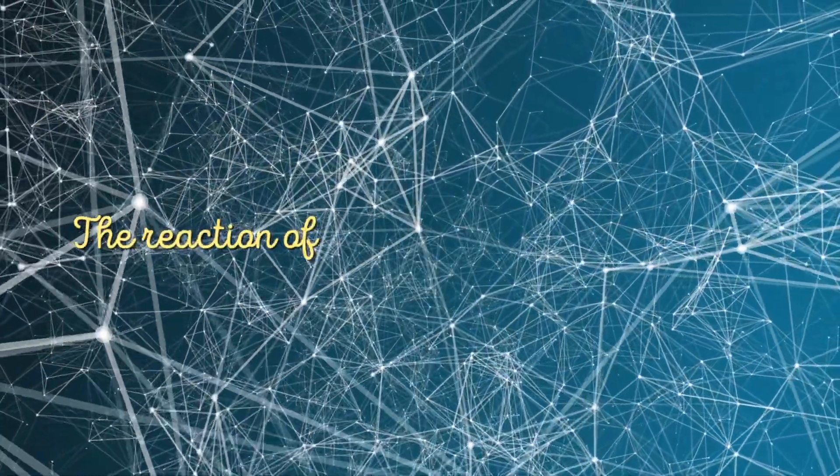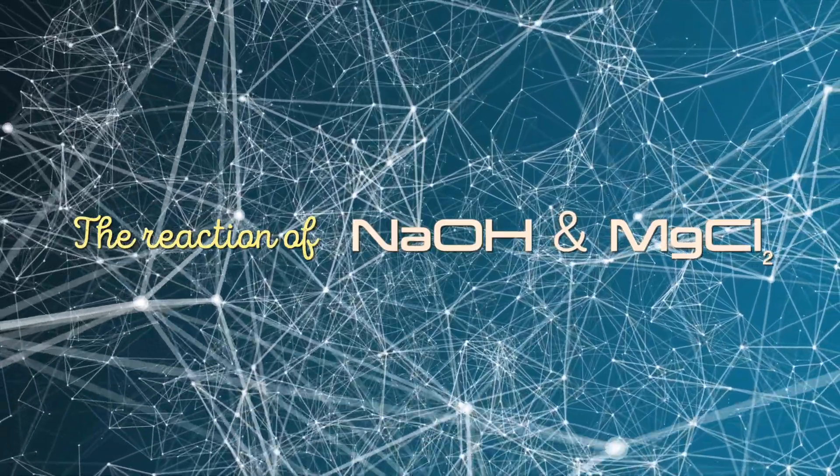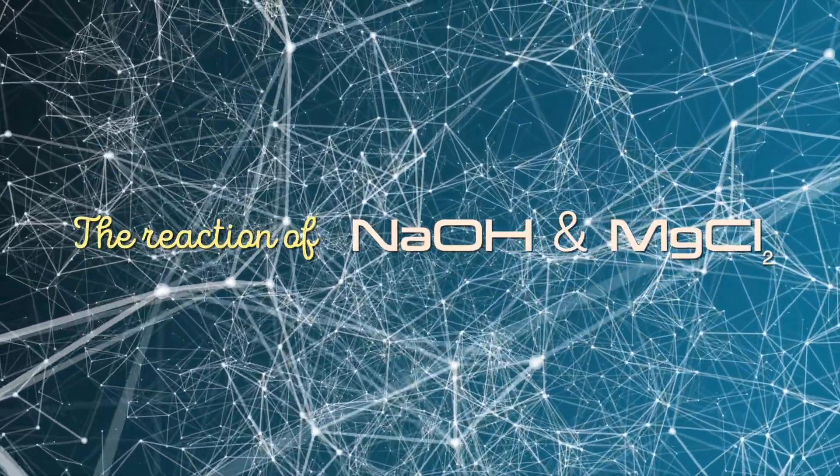Today, we will see the reaction of sodium hydroxide and magnesium chloride.